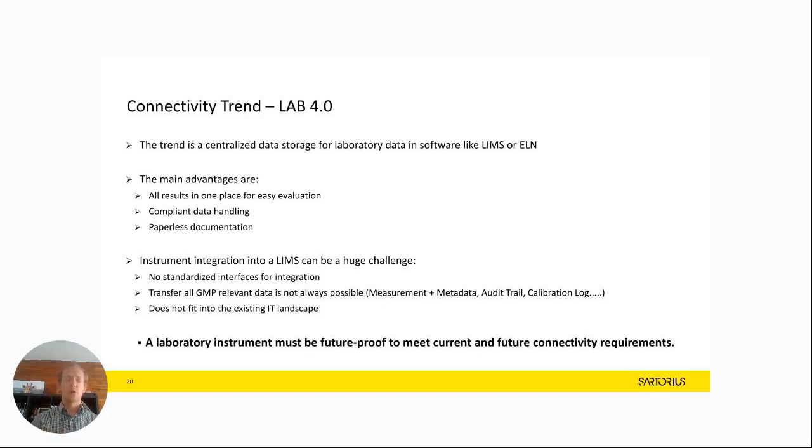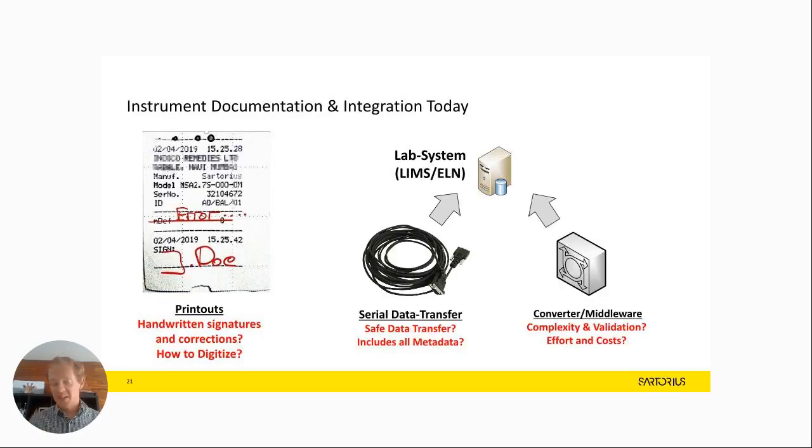I always get the question, okay, can we connect to a LIMS system? And okay, which LIMS system? There are so many individual solutions. And from a manufacturer side, we decided at one point to say, there are so many individual solutions, everyone handles his data and connectivity differently. So we said, okay, a future-proof instrument just has to fulfill all connectivity requirements. That's it. What does that mean?